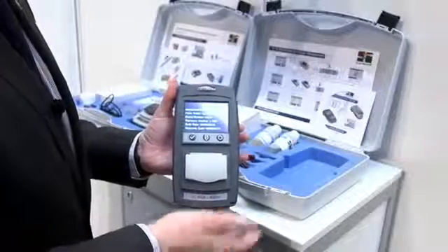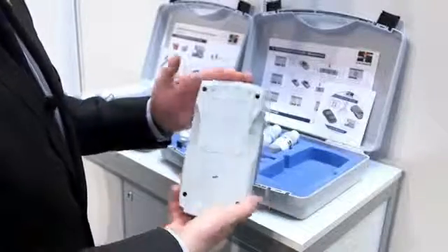We're famous for our comparator instruments, which are visual handheld units, and we're also well known for our electronic PFXI instruments — automatic instruments. This is a combination of the two, the best of both worlds. We have visual and electronic in one portable instrument.